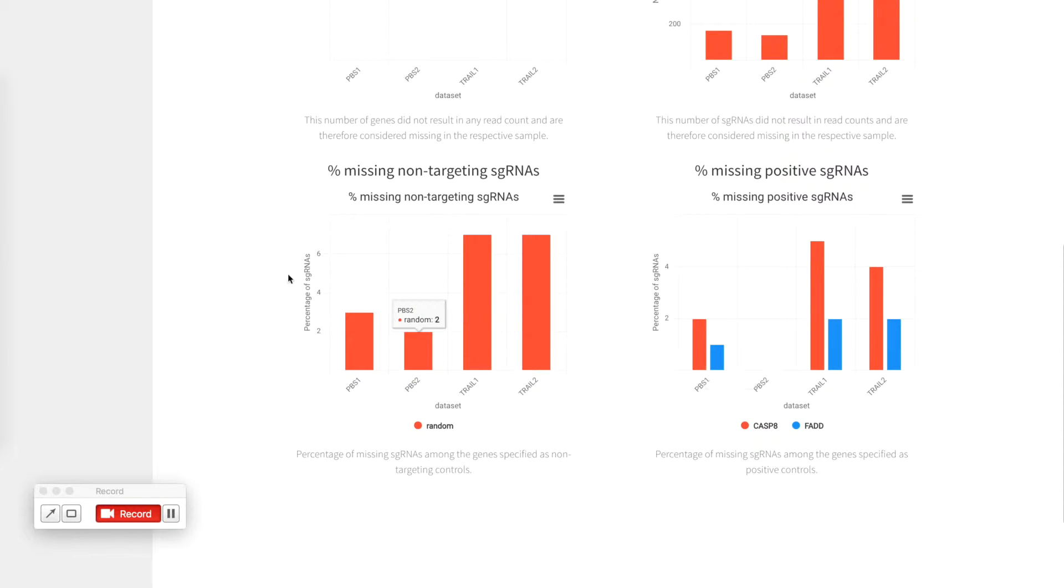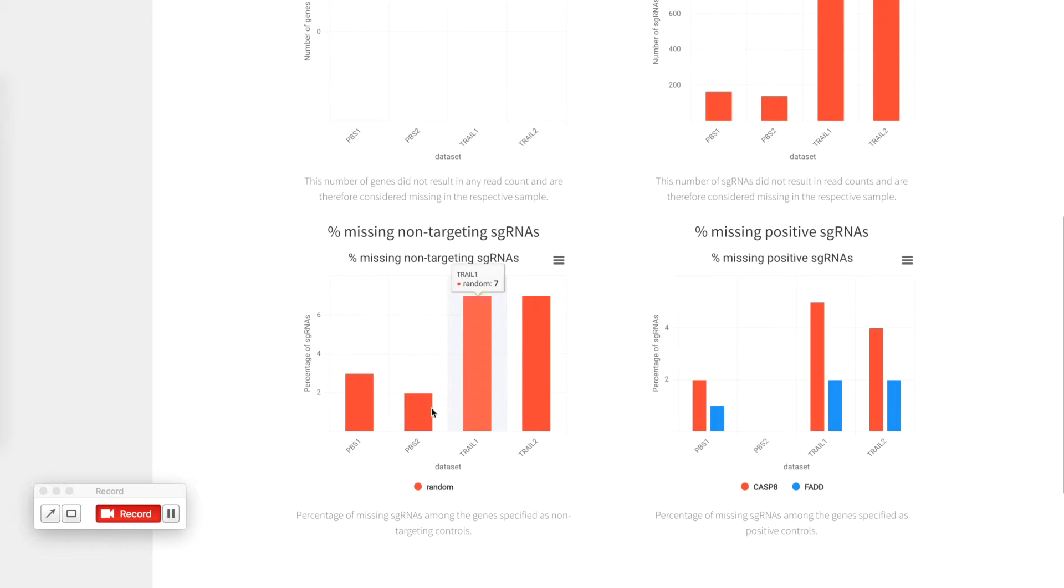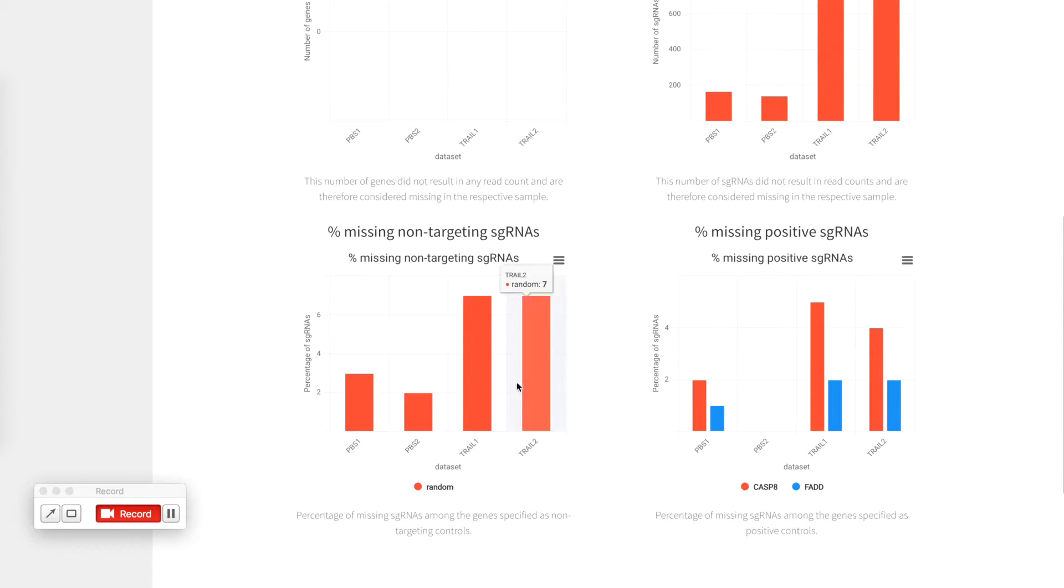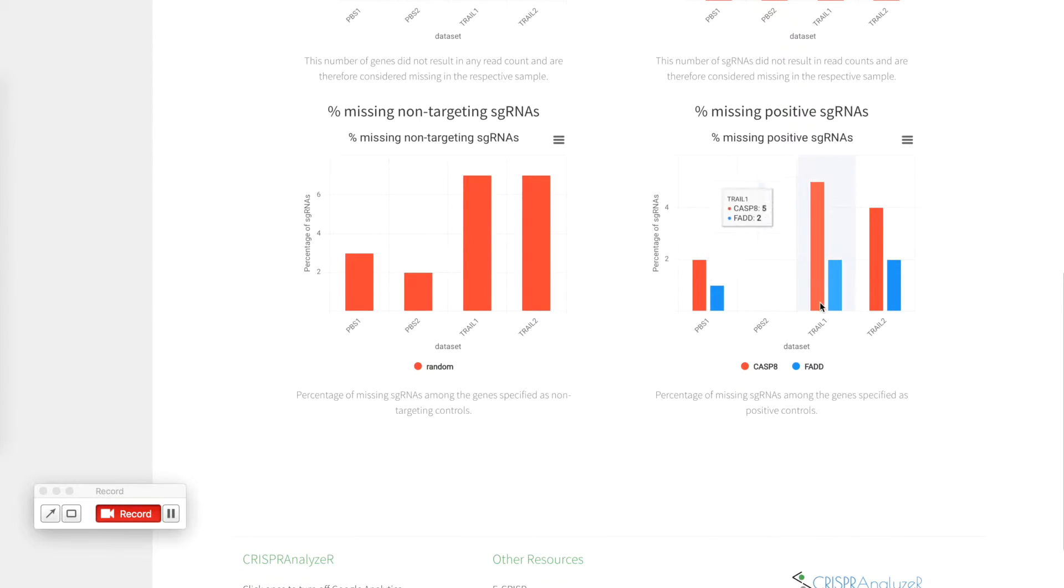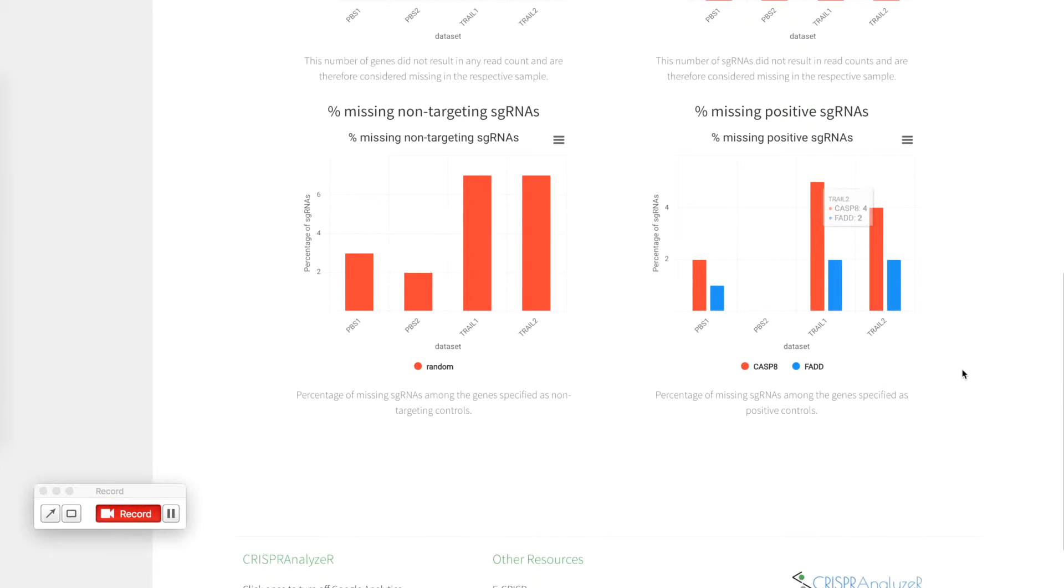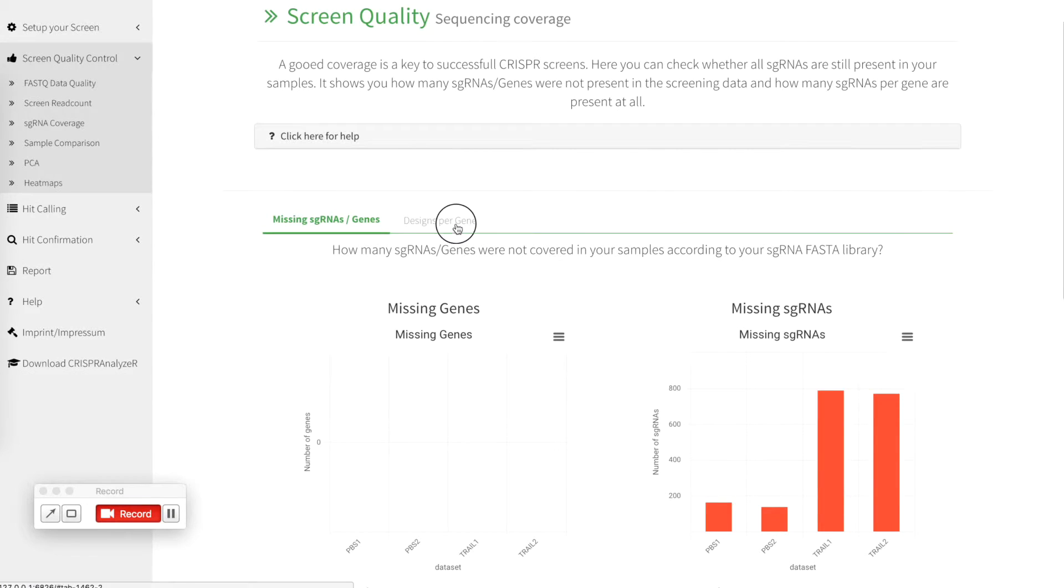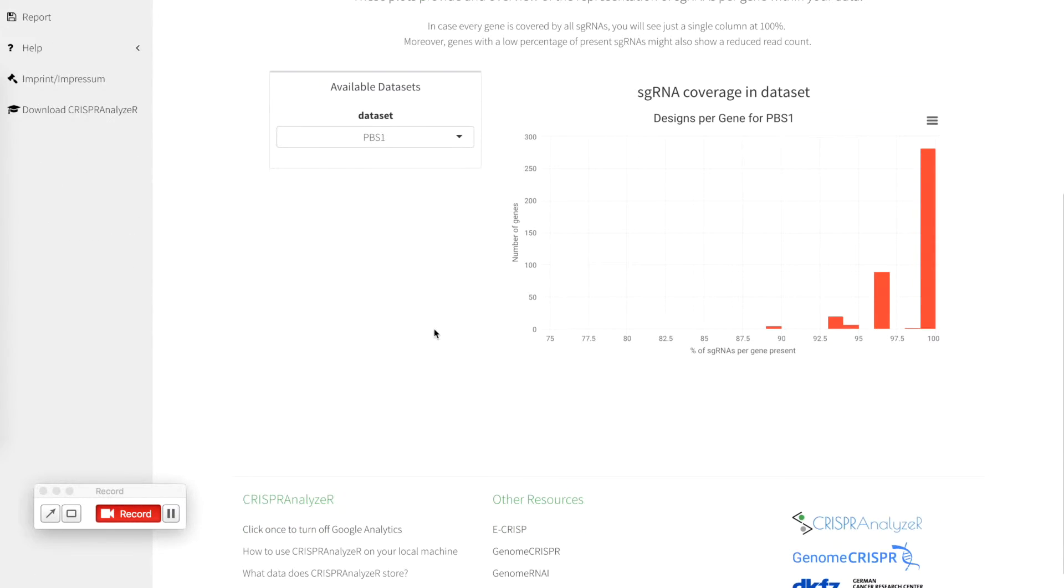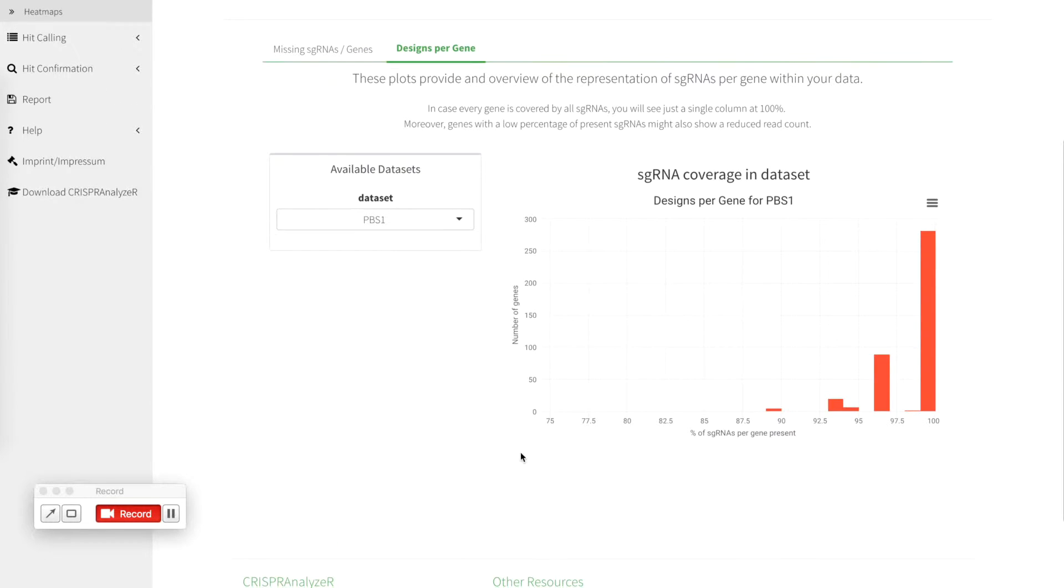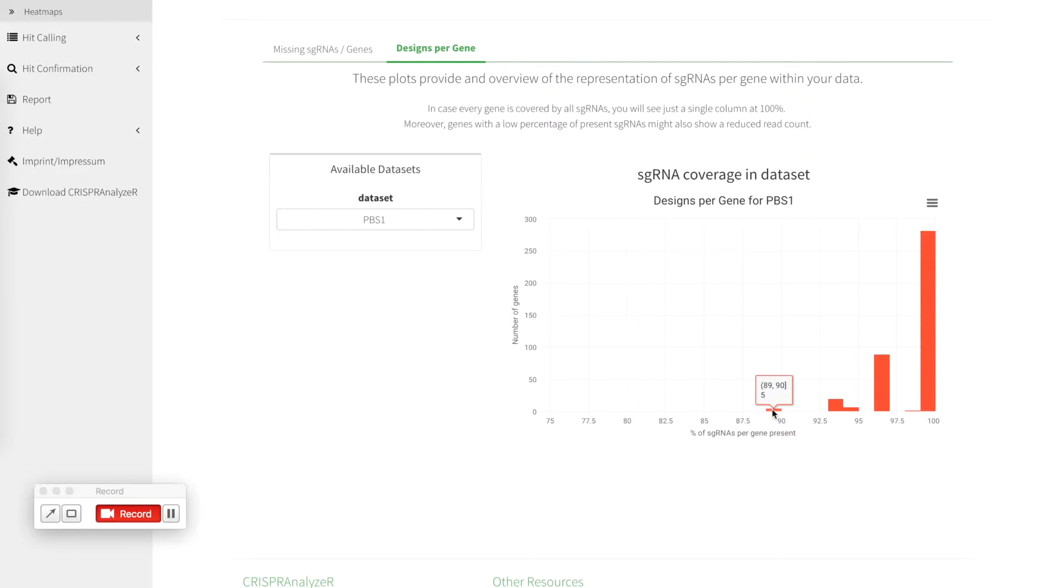You can also see the percentage of missing non-targeting sgRNAs. This should be more or less the same, it's a good quality control and the same for your positive controls. You can also check the designs per gene which means that for example in our previous one data set for 282 genes we have 99 to 100 percent of all sgRNAs and there are 5 genes that only show between 89 and 90 percent of all sgRNAs present.